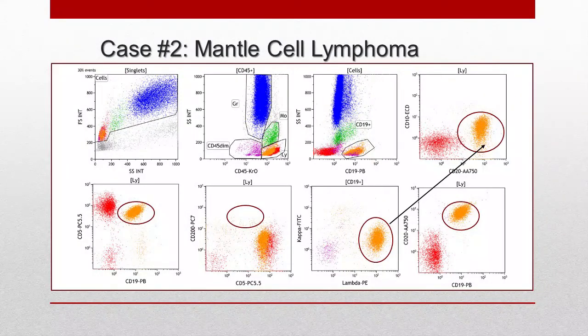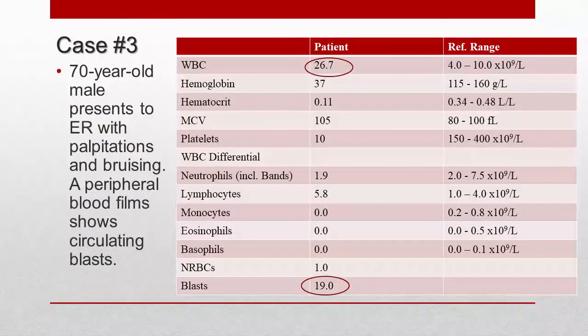There we go, just highlighting what we're seeing here. This is the difference here. You're seeing this lambda, which is actually quite bright, pushing up the CD10 a little bit here, which you have to be aware of in flow cytometry.